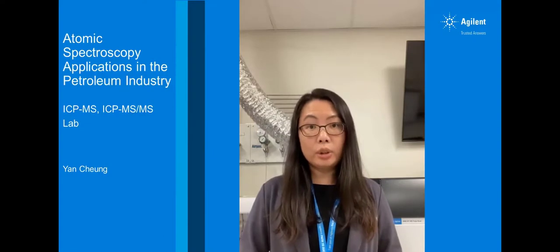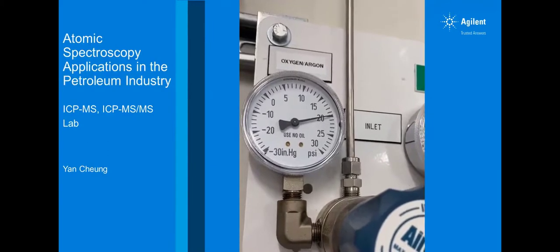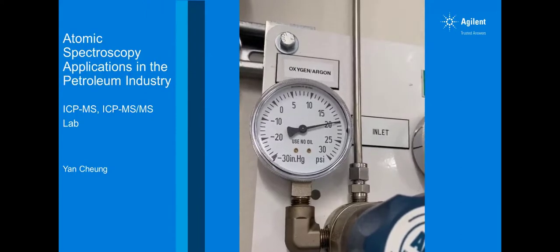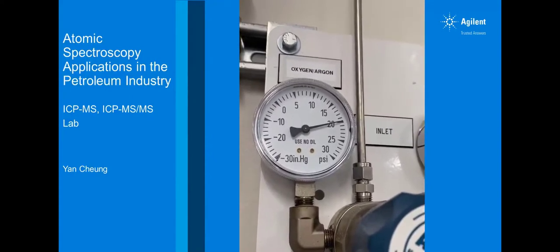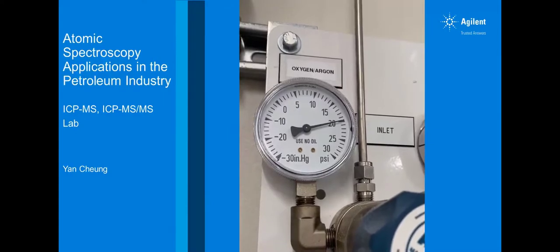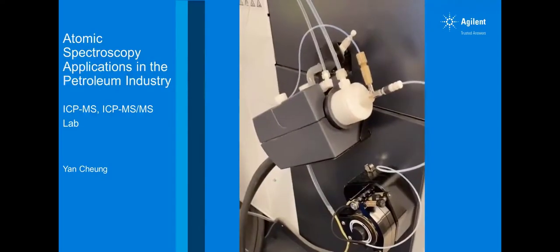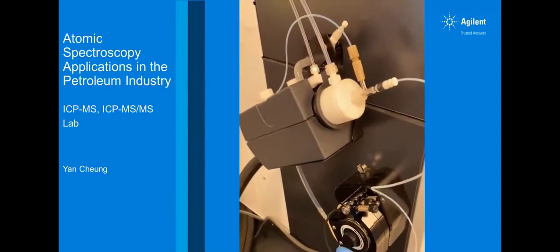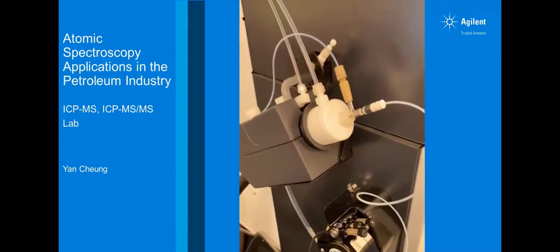Now let's take a closer look at the instrument. Okay, like I mentioned earlier, the requirement to introduce organic solvents in the instrument will be very similar to the single quad ICP-MS that I showed you earlier. You will still need 20% oxygen and 80% argon mixed gas plumbed into the instrument. In terms of sample introduction, you also would need the Viton tubing for the sample tube in the peristaltic pump.